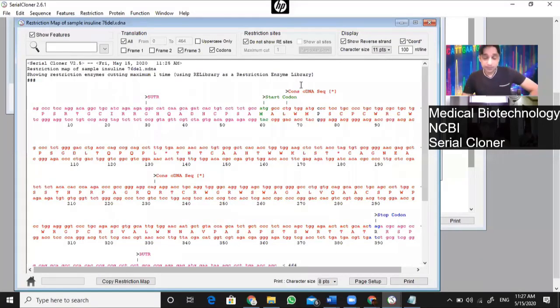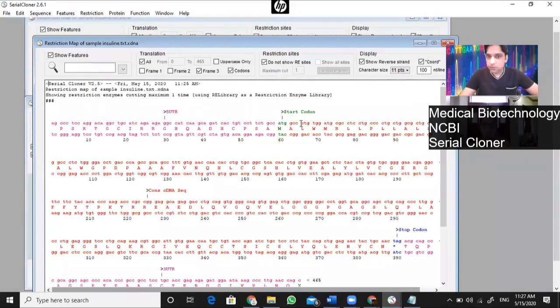For example, if you change the third base pair of any codon, it arranged in codons for you. If you change the third base pair of any codon, you might not see any change in the amino acid. The next amino acid might be the same. The amino acid sequence will stay same. If accidentally the mutation occur in the third base pair of every codon, it does not make any changes in the protein sequence. Mutation is there, but not causing any trouble. Silent mutation. So you suddenly came to know with your own eyes how it will end up in the protein product if nature installs that type of mutations in my sequence.